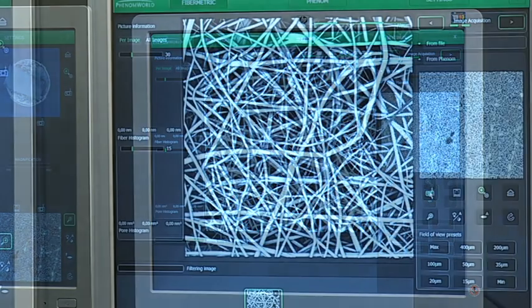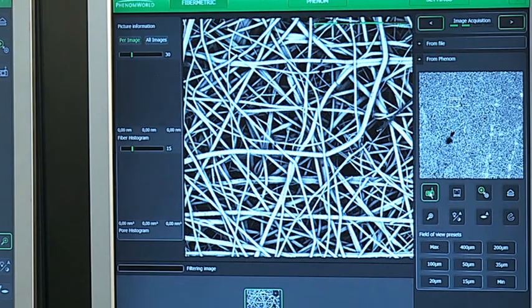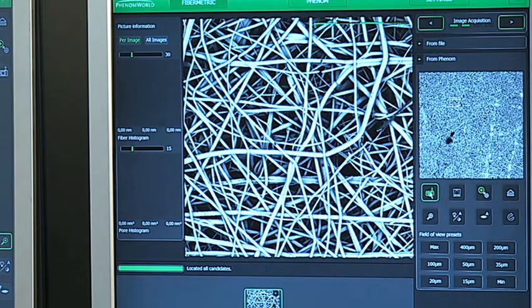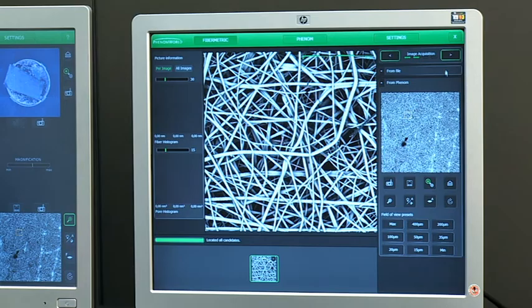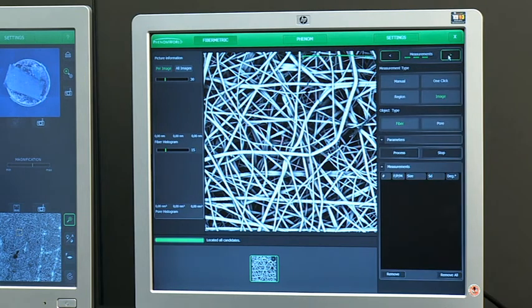When the desired image is collected, it is stored and the candidates for fiber measurements located automatically.